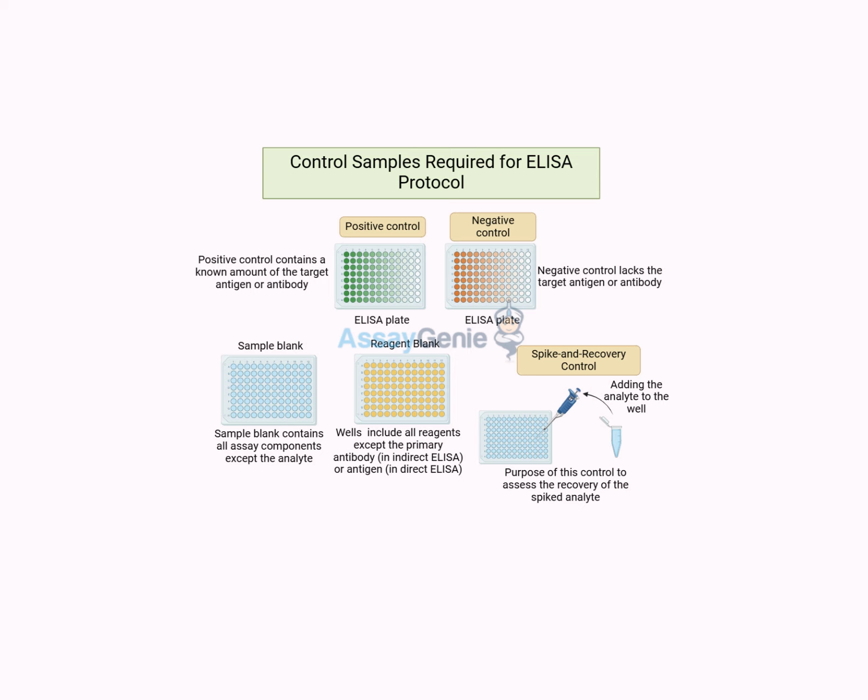Precisely. And this brings us back to something we talked about earlier, the importance of understanding the why behind each step in that scientific process, including the controls. When we really get those principles, we can make better decisions about which controls are essential, which ones can be adapted, and which ones we might not even need. It's like being a chef who not only knows how to follow a recipe, but also understands the chemistry behind why certain ingredients work together. That deeper understanding leads to more creativity and innovation in the kitchen. Exactly. Same goes for science. When we go beyond just memorizing stuff and really embrace those underlying principles, we empower ourselves to be more creative and adaptable and ultimately more successful in our scientific endeavors.